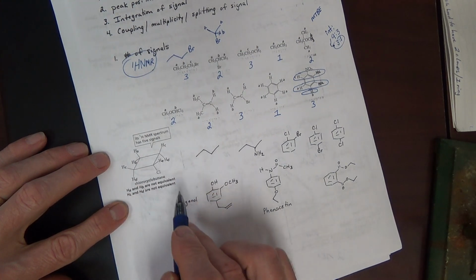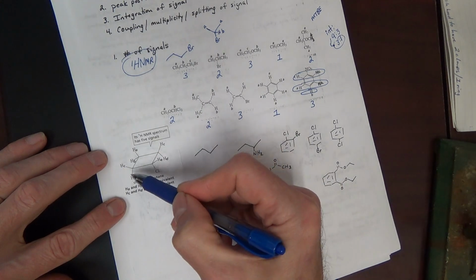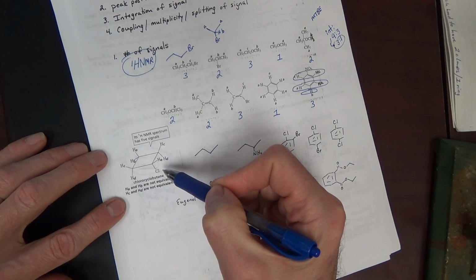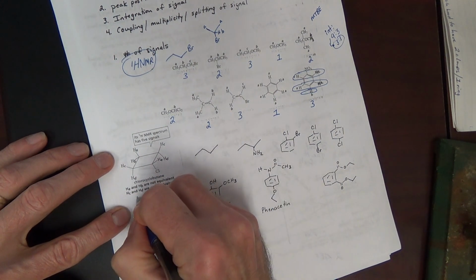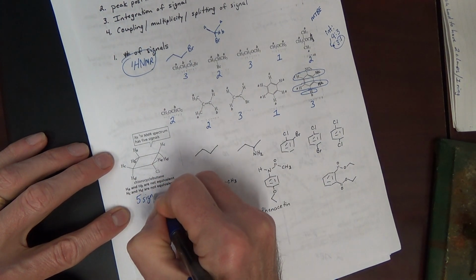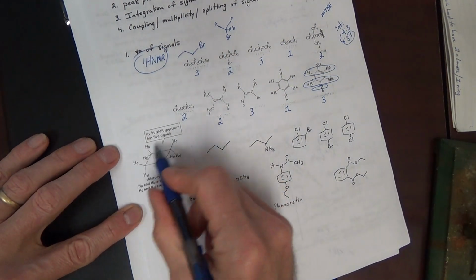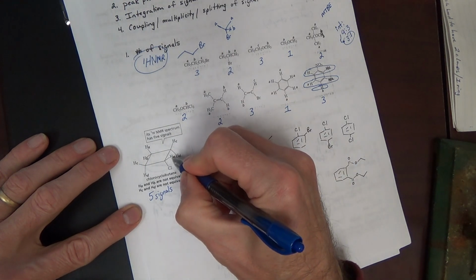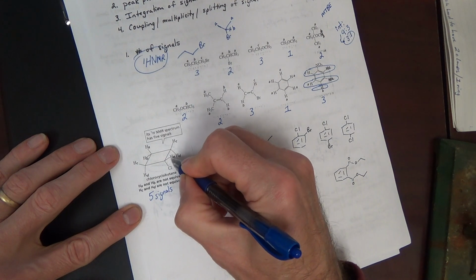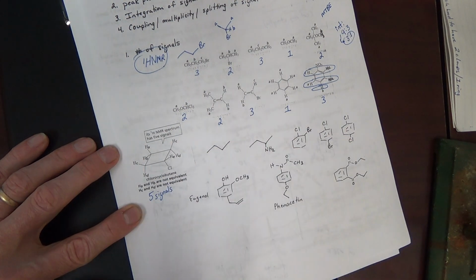It's a cyclobutane ring. How many signals? A, B, C, D, E. Looks like 5 signals. Well, that just comes from counting the A, B, C, D, and E. HE is clearly unique because it's on a carbon bonded to the chlorine, and there's no other H in that situation.